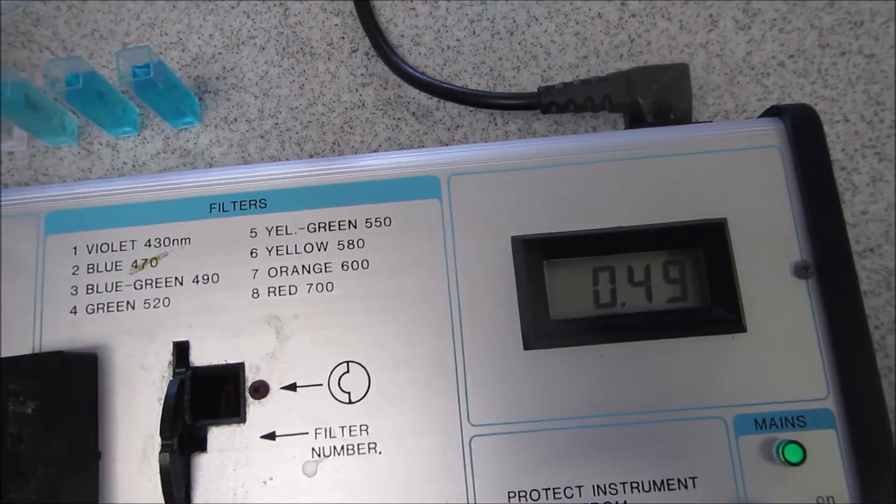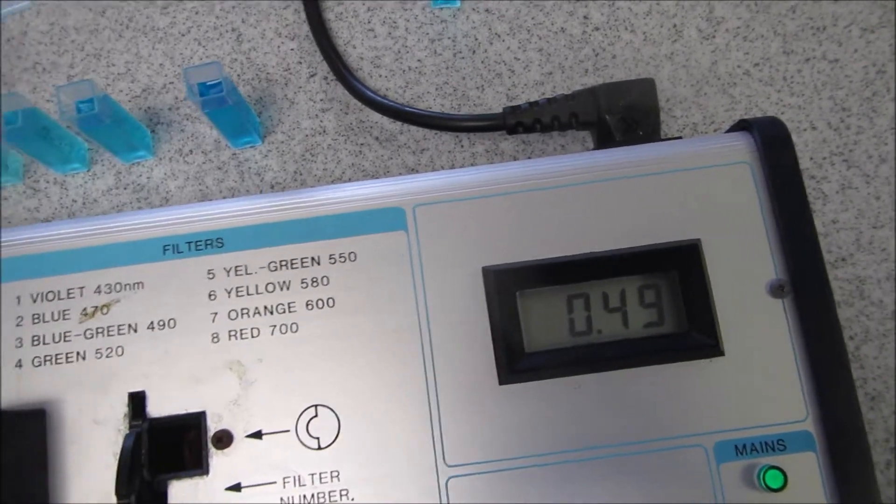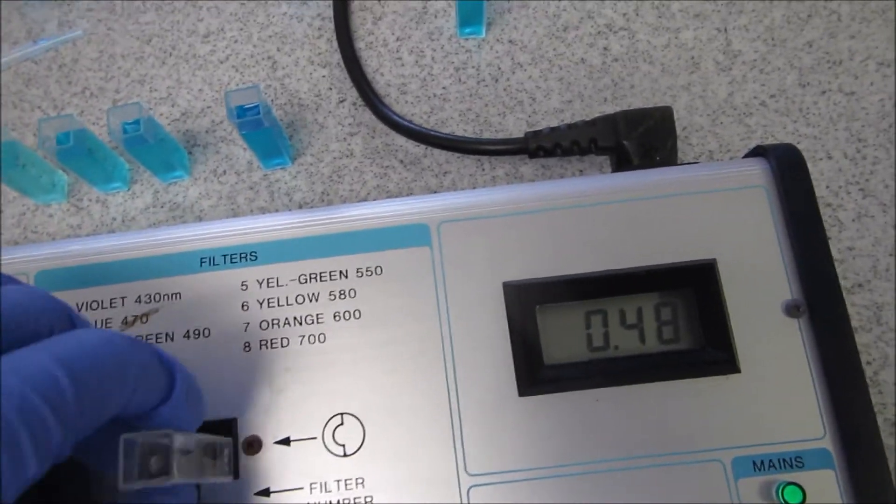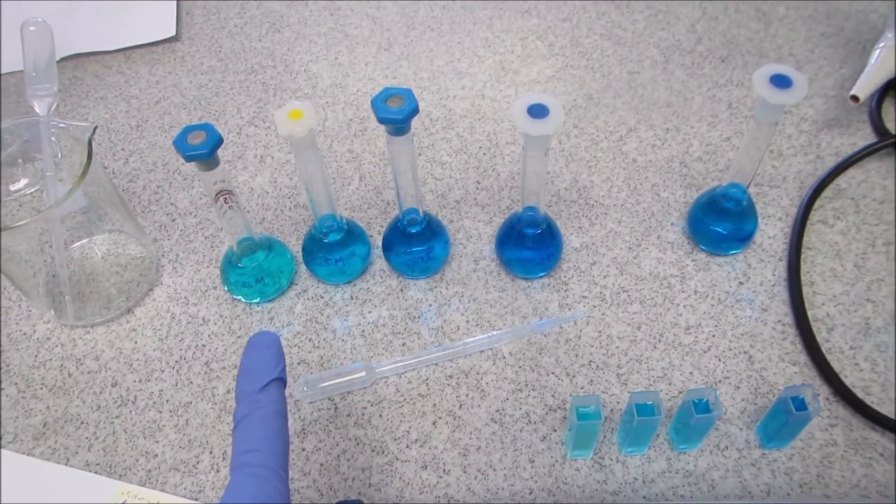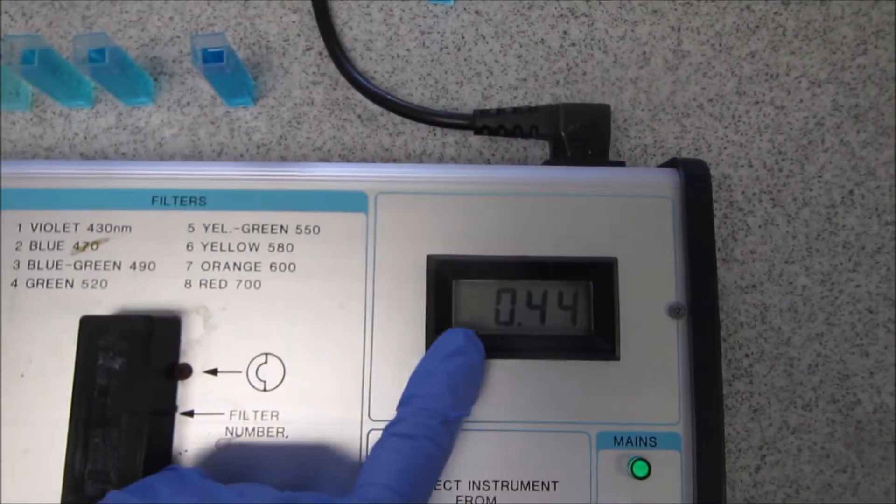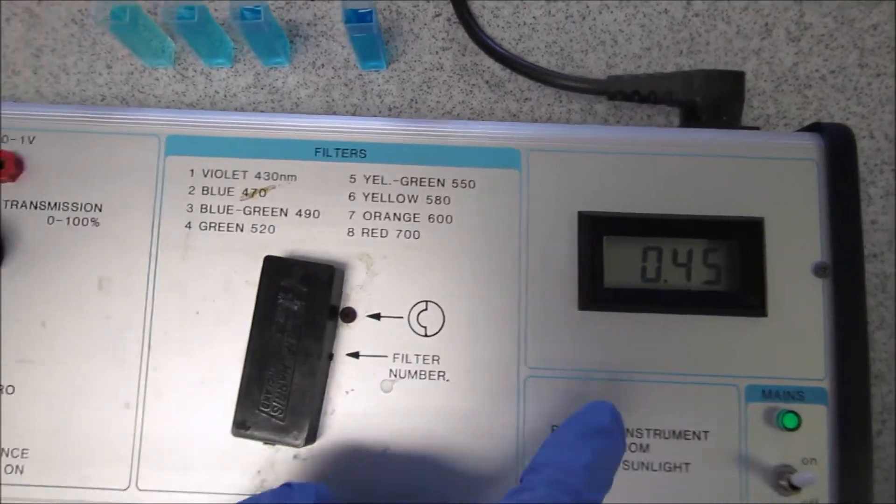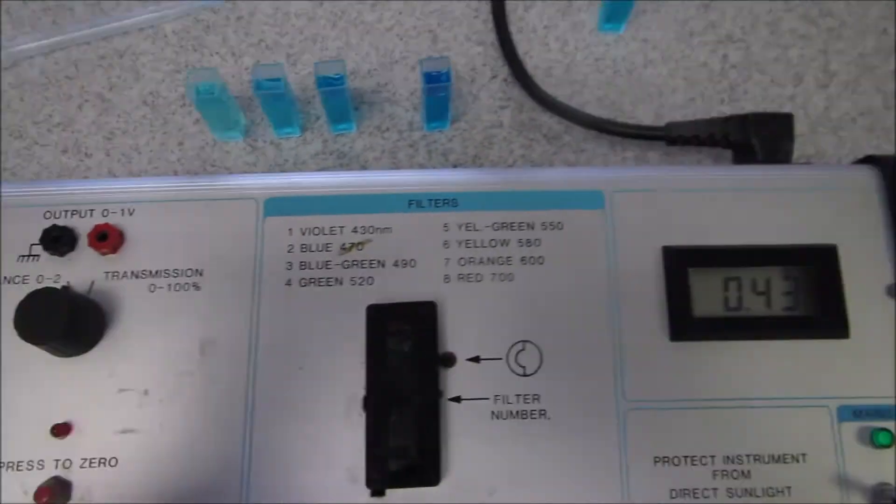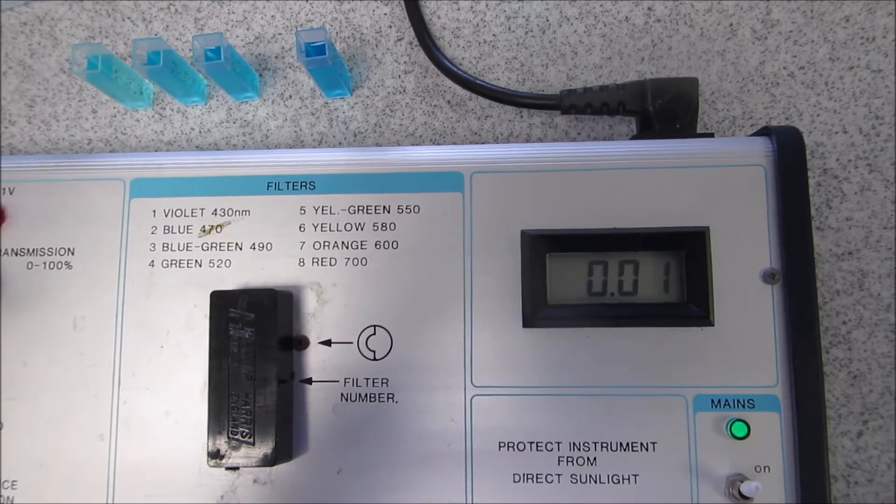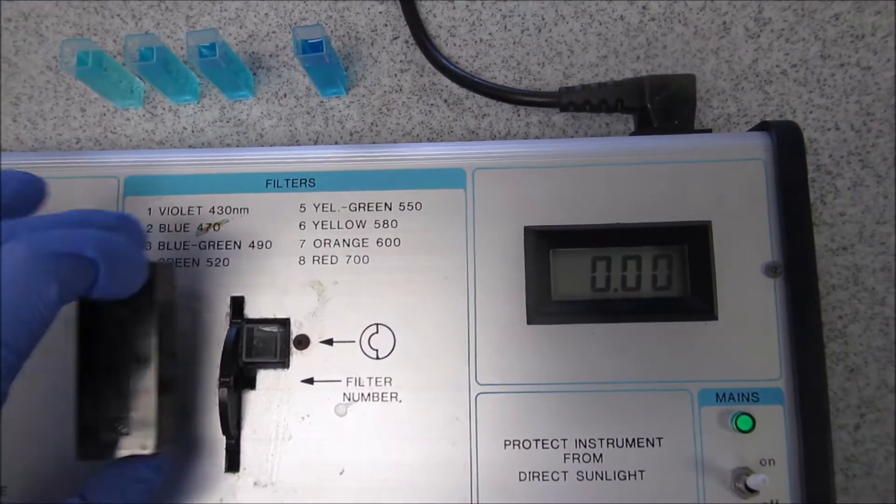First things first, I've got a blank which is deionized water, because when I was making up the copper sulfate solutions I used deionized water to dilute them. I'm putting in my deionized water and you can see there's a reading on the wavelength. I'm just going to hit zero and once it comes down to zero, that's essentially the machine blank.